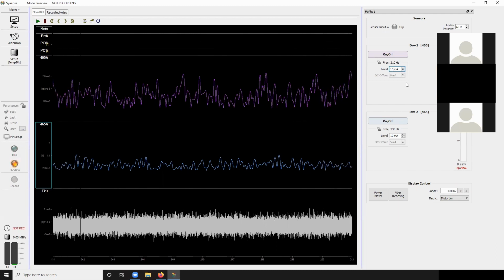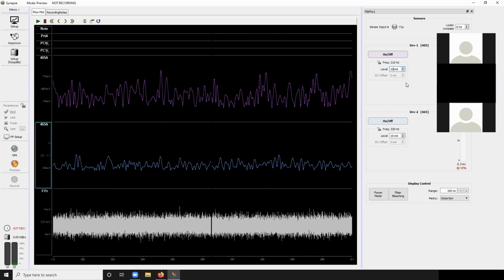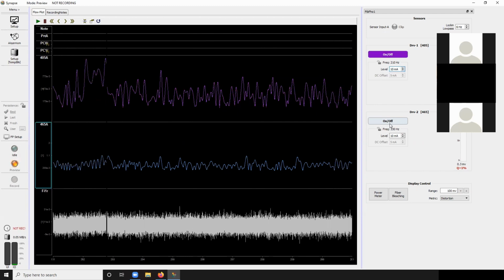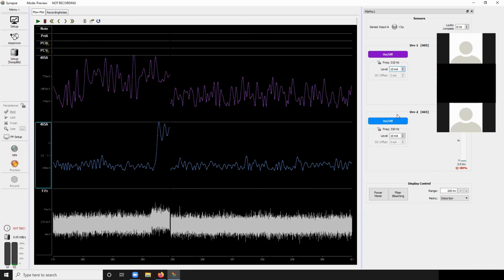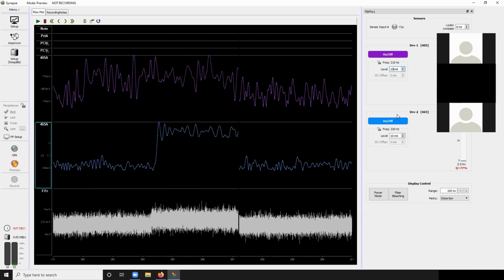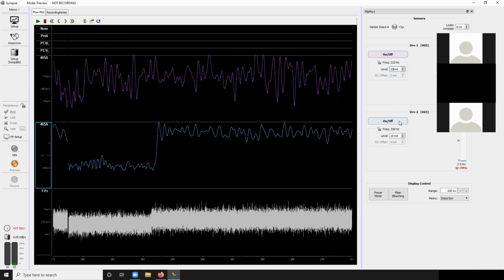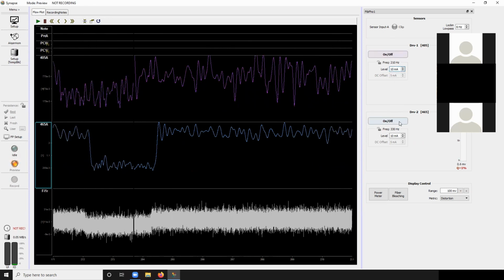In any case, all right, so we hooked up the FCFC connector from the sample port of the Minicube to the PM1. I'm going to turn these lights on. All right, something's not correct here. So let's check to make sure that we connected from the sample port to the PM1, which is on sensor D.